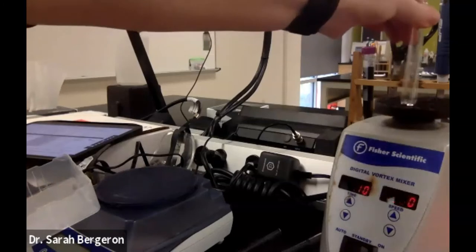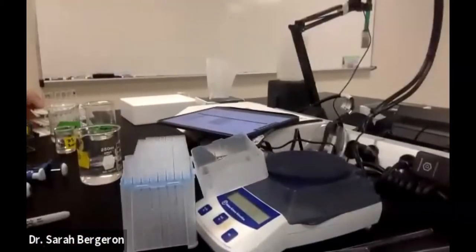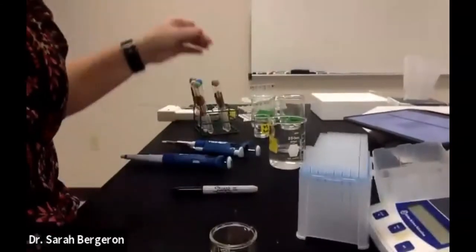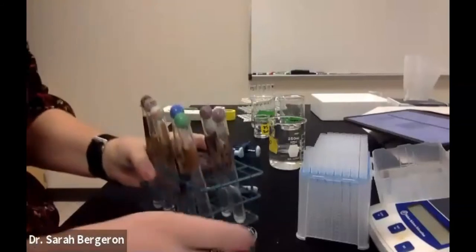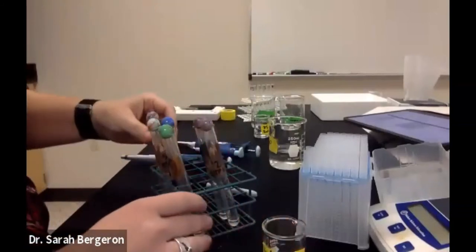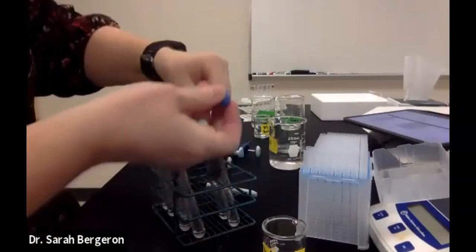Okay, so those are our standards. We're going to incubate those in a second. But now we need to work on our samples. And I have stolen samples from a group. I'm not telling what group. Okay. Let's see. All right. So we can take all of these marbles off. Put them over here.